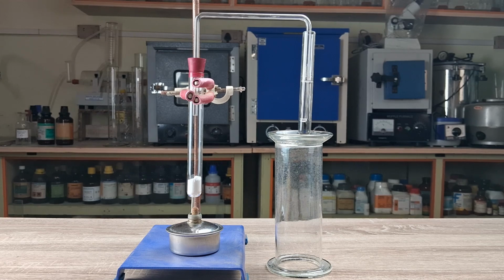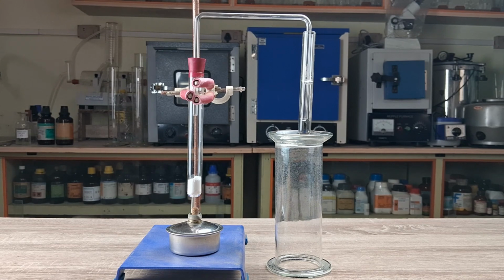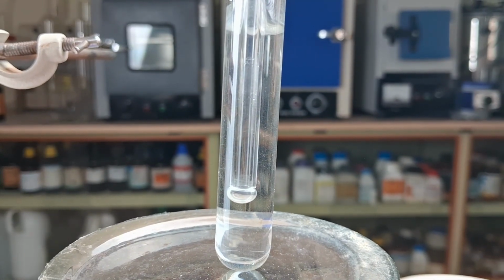In the case of calcium carbonate decomposition, the end product is a white residue of calcium oxide along with carbon dioxide, which is emitted in the form of a gas. The identity of the gas can be confirmed by passing it into a solution of calcium hydroxide, commonly known as lime water, which then turns milky as it reacts with carbon dioxide gas.